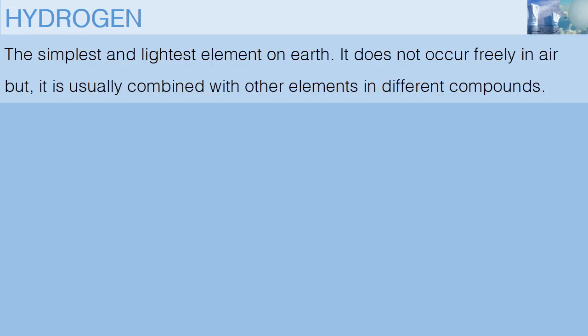The next element for this topic is hydrogen. We have already talked about water and its reactions, and we have realized that in a special way, water generates hydrogen when it reacts with metals. Interestingly, hydrogen can also generate water when it reacts with oxygen.